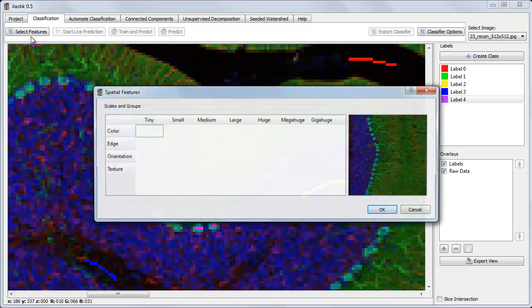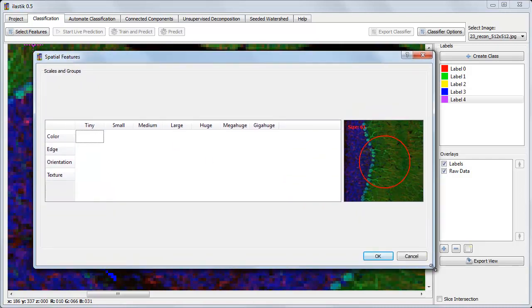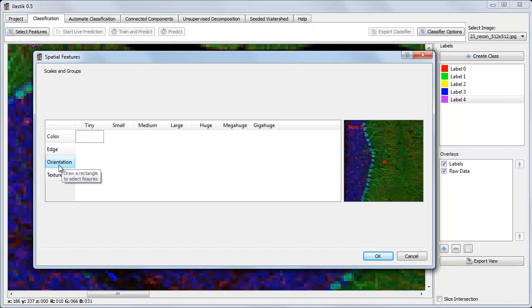So we can click on the Select Features box, and choose features from four different groups in a variety of sizes. In the upcoming videos, I'll discuss what each of these feature groups means. For now, let's focus on the size of the features.